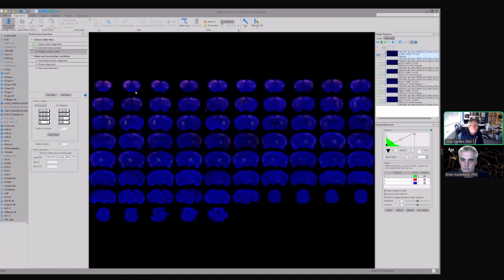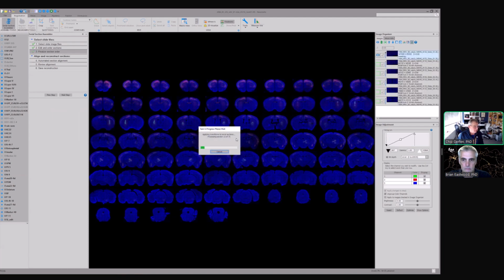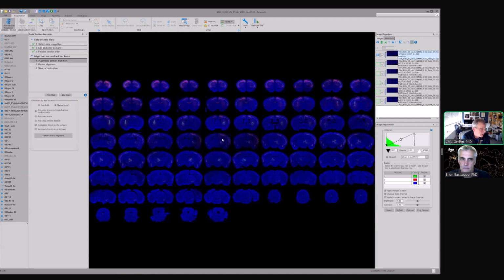The next step shows the contact sheet, applying all of the alignment transforms that were used before. Anyway, it goes through all of this. So this is a very useful part of the program: if you make mistakes, or you come back, this has happened to us. Sometimes we say, somehow we missed a whole slide and we didn't put it in. And so we come back and we could actually add it using this case file process.